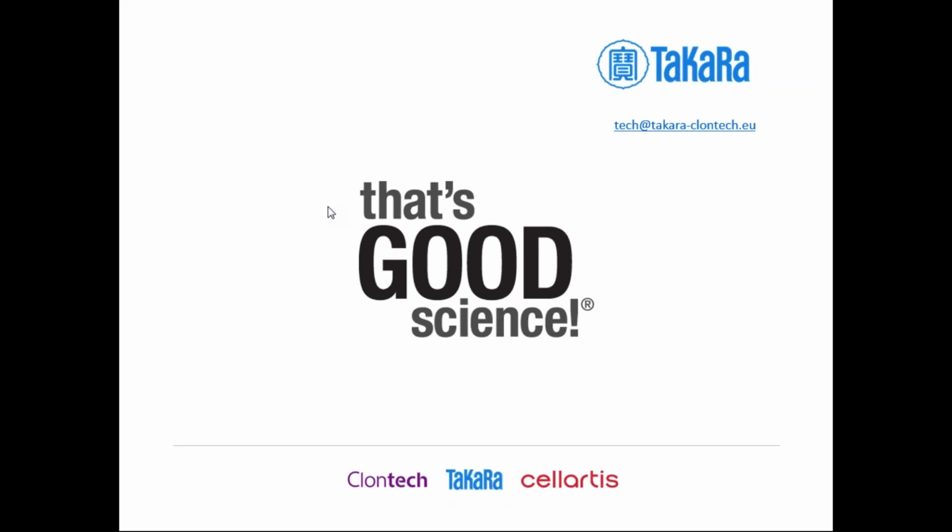So for the moment, we don't have a protocol to get this into the Gesicle, and you would need to deliver the repair template separately. So meaning you would need to use electroporation or transfection. And then the question is more, what's the best time point to deliver the repair template? You would need to determine this empirically to see whether it's better before or after the Gesicle delivery.